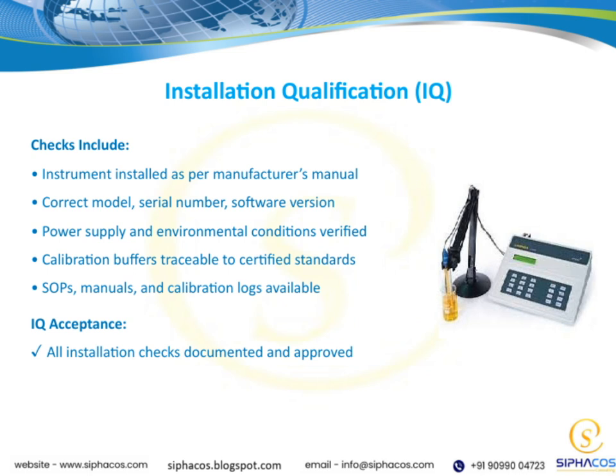Lastly, we confirm that all necessary standard operating procedures, manuals, and calibration logs are available and up to date. When all these checks are completed, the IQ is considered acceptable. Remember, documenting and getting approval for these installation checks is vital.